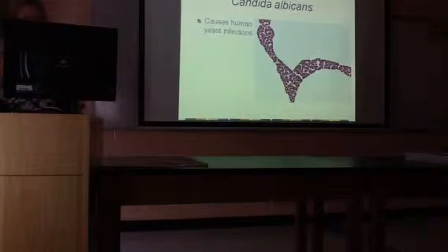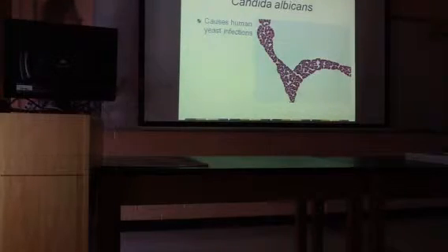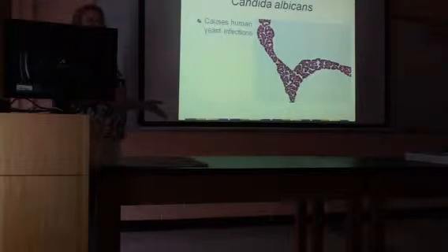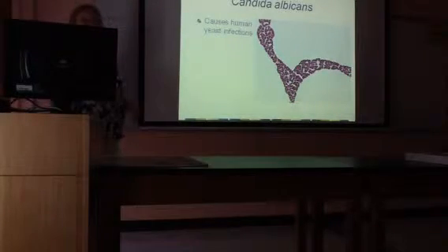Okay, this is going to be a tough one. Candida albicans. This is a yeast, the one that causes human yeast infections. Okay, so different than the yeast that you looked at before that we used to make beer and wine. We're two completely different species.